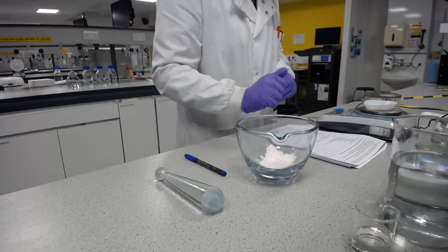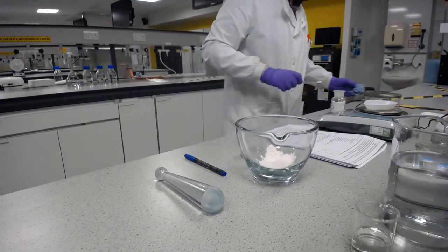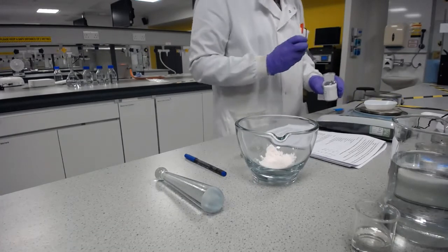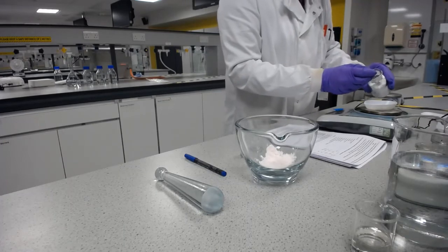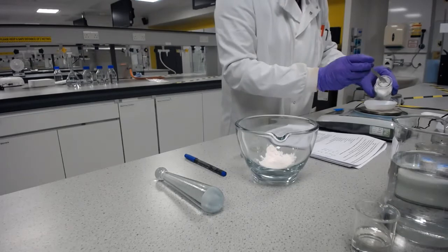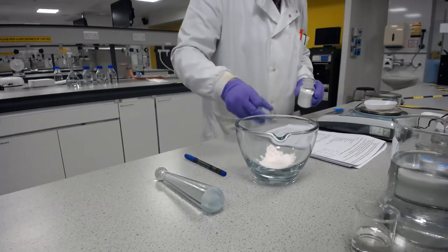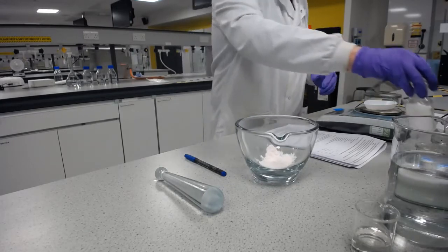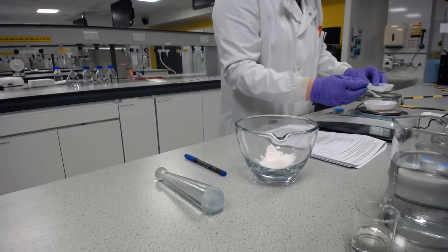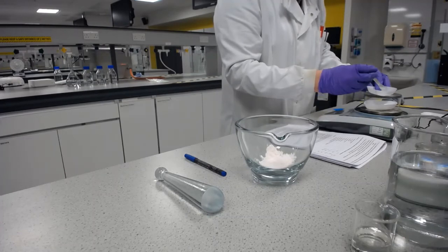And we now need 2.5 grams of zinc oxide. I'm just going to give my spatula a wipe to make sure I'm not contaminating the zinc oxide. And again, I've gone over. I'm going to put the excess in this weighing boat. Now this wet excess, as I said, is going in the solid waste, so I'm not worried about mixing the different wastes.